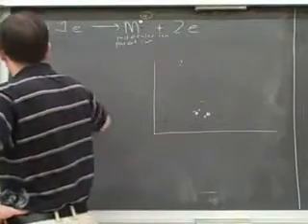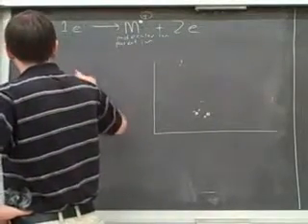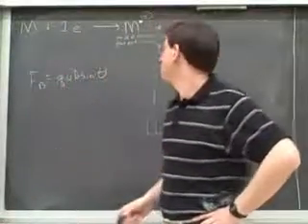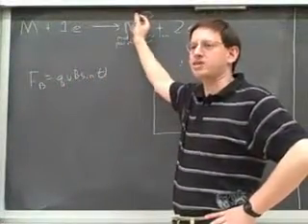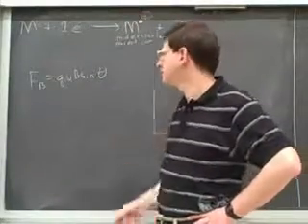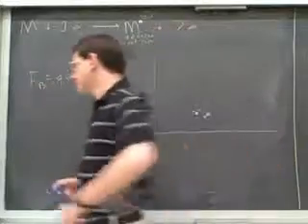Do you remember the formula for magnetic force? QVB sine theta. It only affects particles with a charge. That was the whole point of making this into a cation, so that it'll be affected by the magnetic field in the detection apparatus. We need to give this a charge so that it can feel the magnetic force.